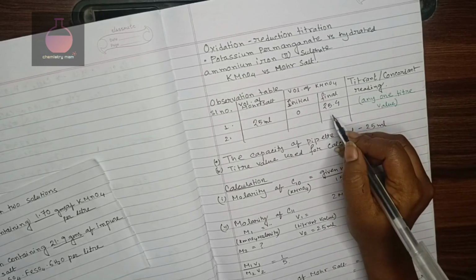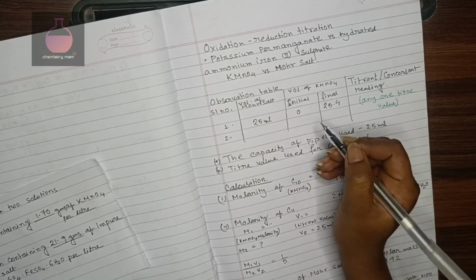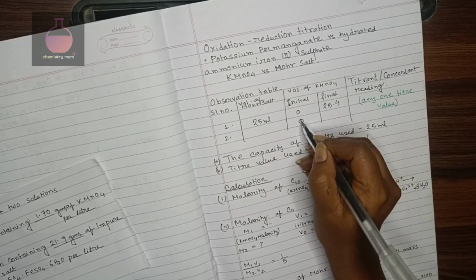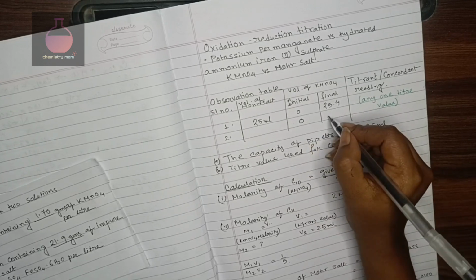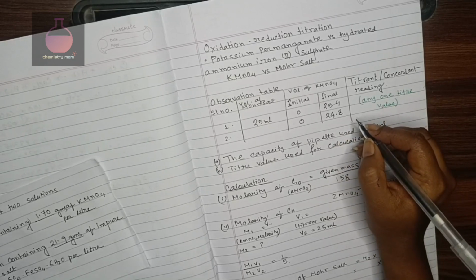Suppose in this case my value is coming 25.4. I will go for the second time and again you can take this value and subtract from it, or else you can start with 0 again by filling up the burette. Suppose in this case you are getting a value like 24.8. So this much value can differ.